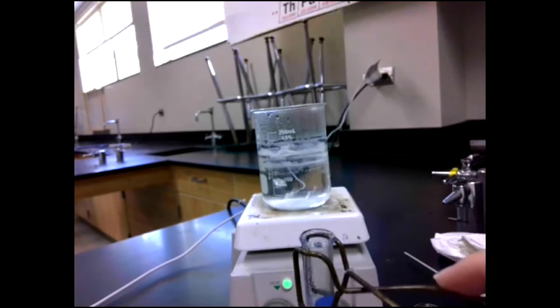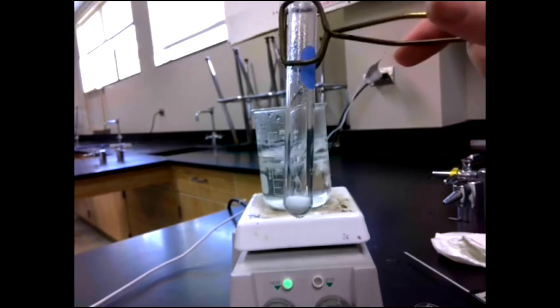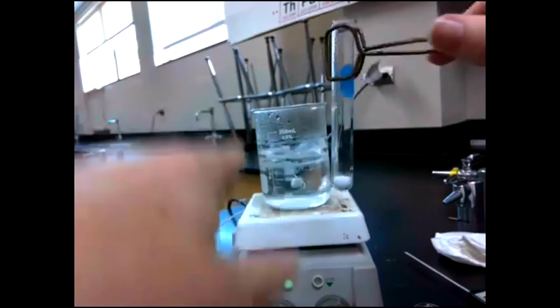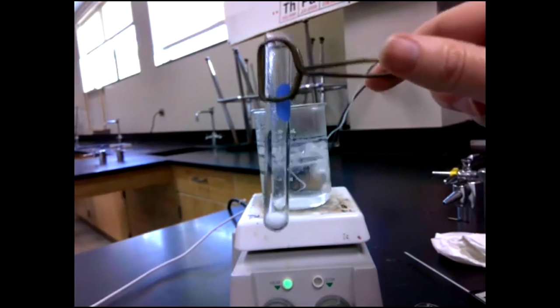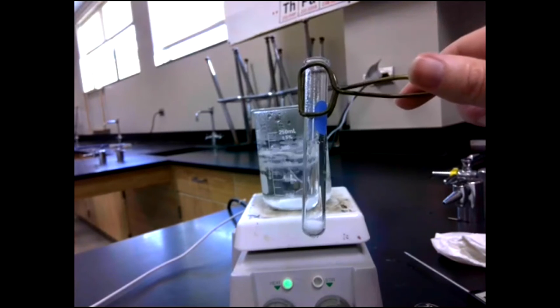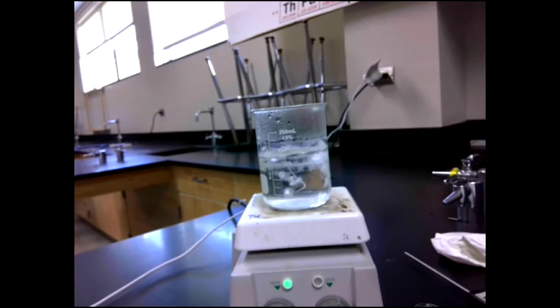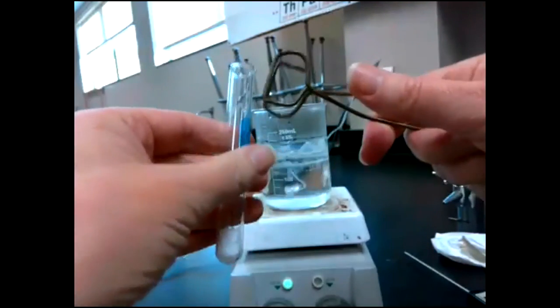So we don't know what temperature this would melt at. So what we are gonna do for this is say, we know it doesn't melt below 100. We know it's higher than that. So we're gonna say that it has a high melting point. So you can make a note that it didn't melt at boiling water temperatures, but we're gonna just label that as high. We don't know its actual melting point. So now we're gonna do B.